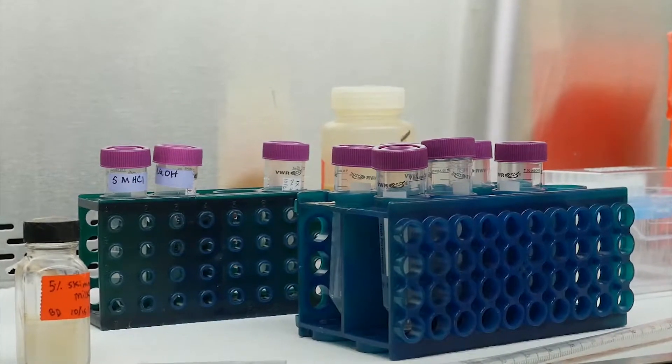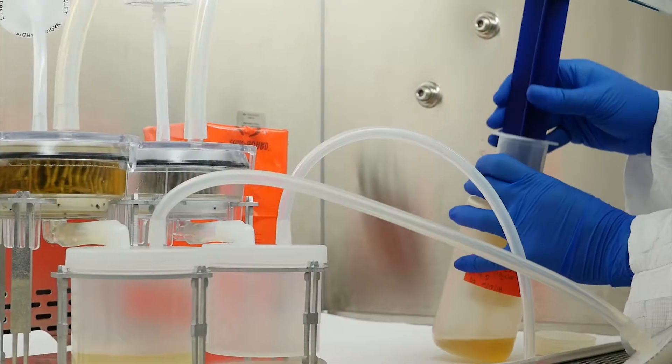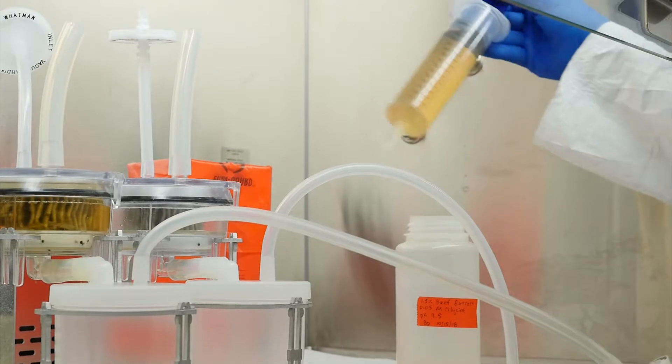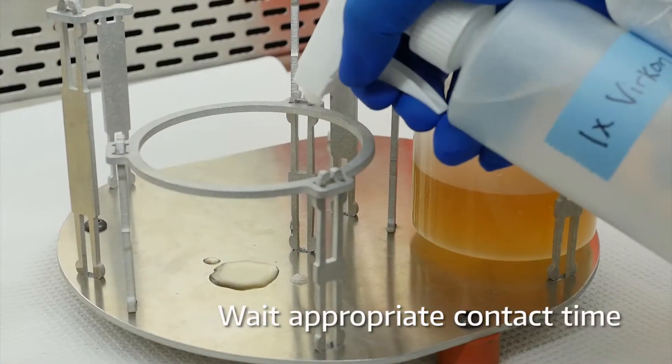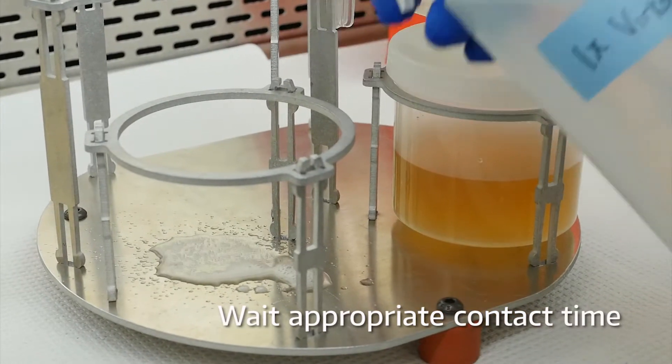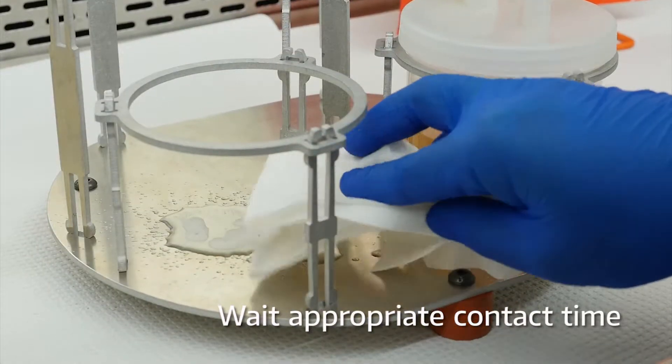Protecting the sample and laboratory from cross-contamination is imperative. Cross-contamination can be prevented by using good laboratory practices and proper exercise of sterile technique. Following a spill or contamination by the sample, the surface must be immediately disinfected with a primary disinfectant such as bleach, Vircon, or Oxivir.